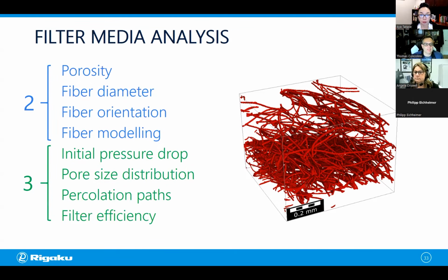What's the lower voxel limit for the Nano 3DX? What's the smallest voxel size we can choose? 325 nanometers, or 0.325 microns. Remember, we need multiple voxels, so we can see something that's several voxels in length, so about a micron.